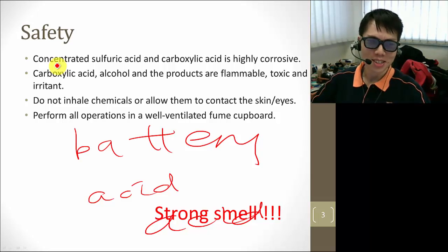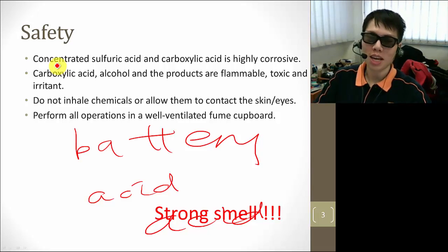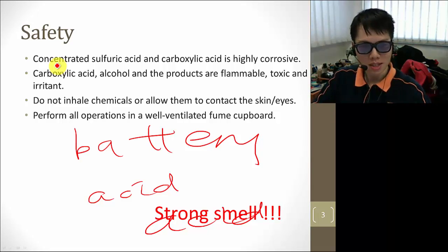Very dangerous indeed, so take care when you see that there's a drop of liquid on your fume hood and you suspect that it is not water or it may be some other chemicals. It could be sulfuric acid, so do not just take a piece of cloth and wipe it. Use a piece of tissue and see whether it corrodes, because it could very well be some concentrated acid.